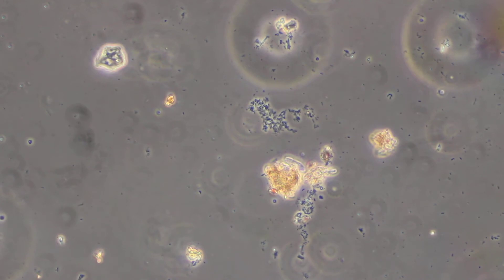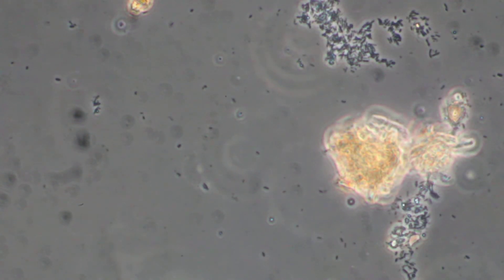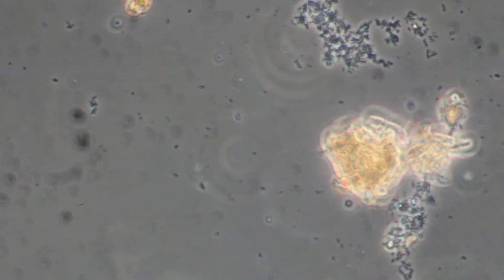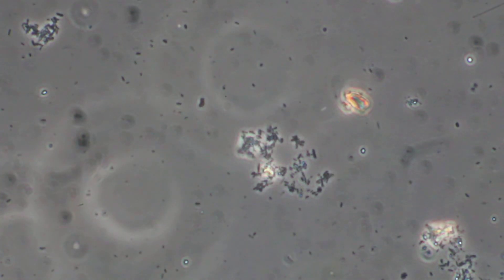If I go up to 400 times magnification, you can see there's just really not a lot going on here. Again, some bacteria, but not much. A few flagellates, as we move further along the slide.